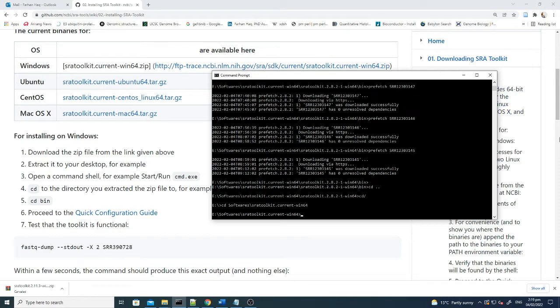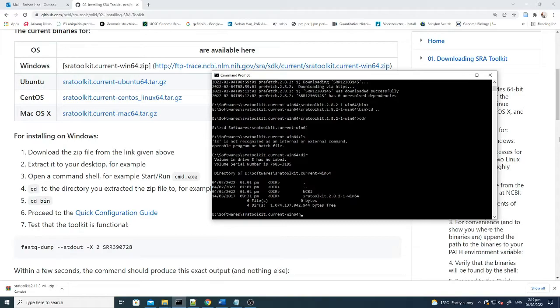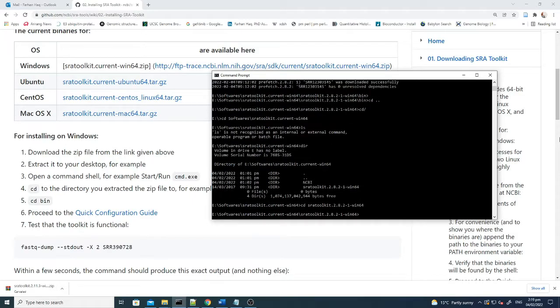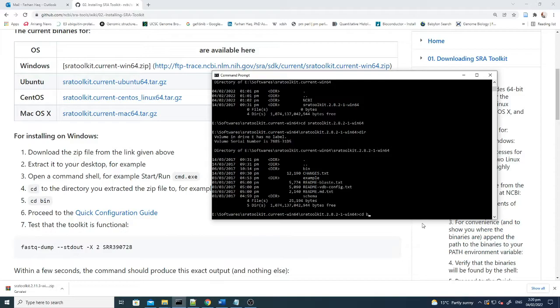There is an SRA toolkit folder, and this folder has a lot of files and folders. The documentation says you need to go into the bin folder to check whether this is working or not. You click here and write CD bin.